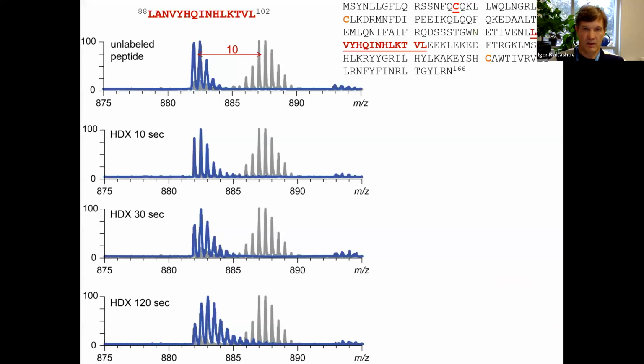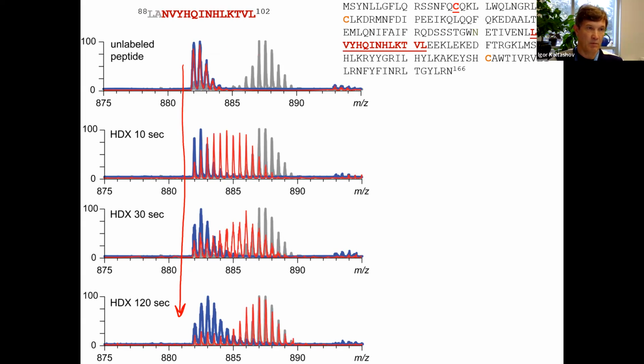Specifically, if you look at the intact protein over a period of 2 minutes, there is very little change in the isotopic distribution. So very little incorporation of deuterium. But if you look at the same peptide derived from conjugated protein, that's the red trace, you see that even after 10 seconds, we begin to see very significant deuterium uptake, right? So now it becomes a very dynamic part of the protein.